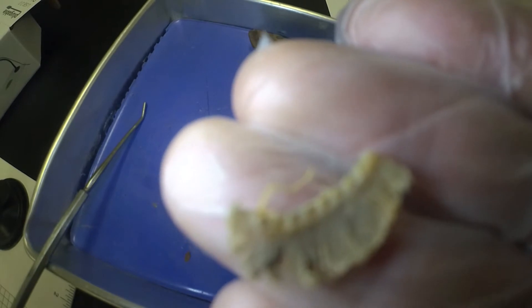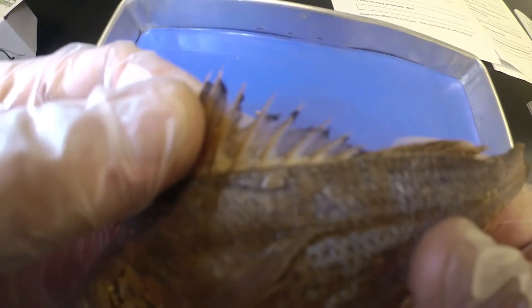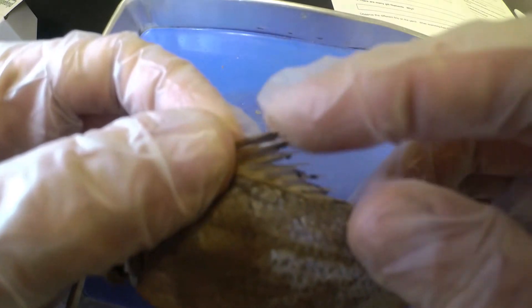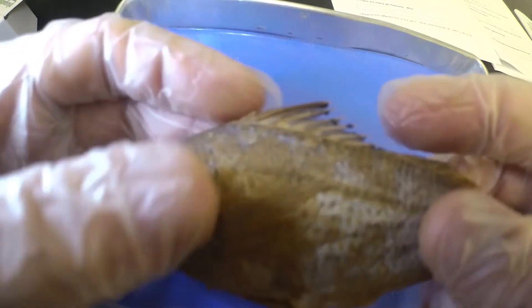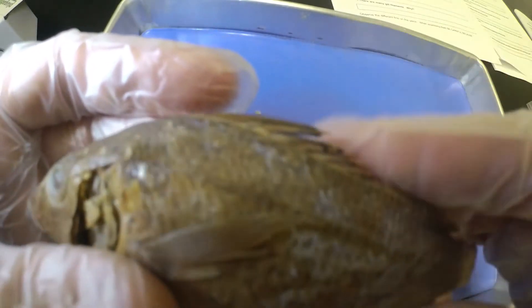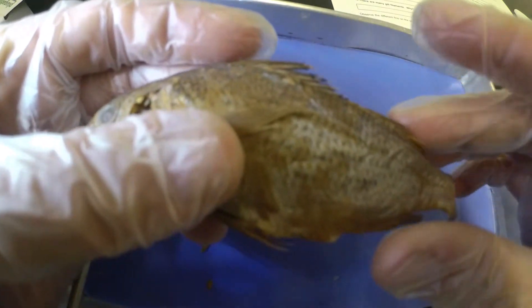Next we're going to look at the anterior dorsal fin, which is this top fin. Anterior means in the front, so this dorsal is on the top and the anterior is the front one. We can see it's got these spines — if I come from the front the spines really don't affect me, but if I try to rub my finger from the back, you're going to get stabbed by those spines. They stab you if you come from the back.